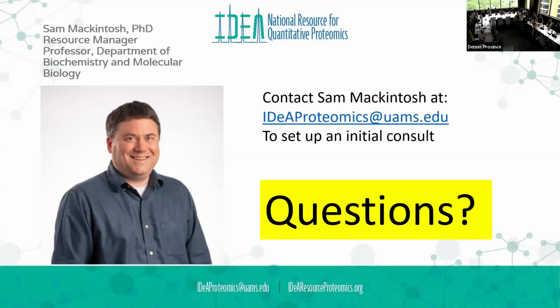People still do spectral counting, and there's a way to normalize those, and that's fine. It's just a legacy way of doing it. Can I put that in a nice way? You're saying it's an old technology? Yeah.